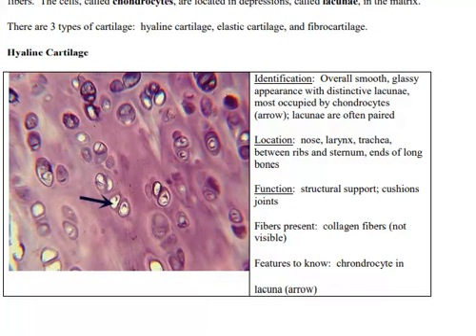So in this picture you see the lacuna and the cell living in it, and then all the stuff that's stained purple around it in this particular instance is hyaline cartilage. So there's some collagen fibers in there for strength, but hyaline cartilage is a thinner, almost translucent connective tissue. It's tough, it's flexible, and you're going to find it in your nose, in your voice box, which is called a larynx, in your trachea, and between your ribs, and covering the ends of your long bones.